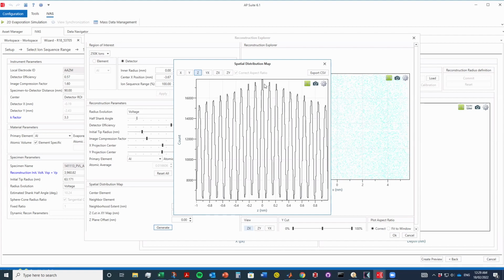and then you've got a central peak here, and the peak to peak distance is representing the reconstructed plane spacing, right? So usually what I do is I won't just take the first peak and look at this distance. I usually go out a bit further to take away any sort of measurement error there, right? So it's the first peak, second, third, fourth, fifth. The sixth one looks nice and sharp here. So I'm just going to take the sixth one.